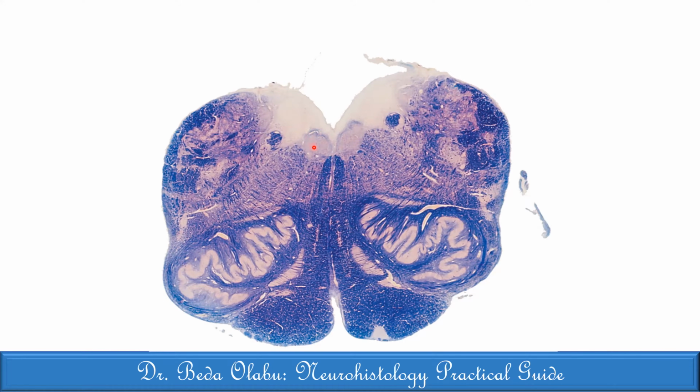Here where the doctor is pointing, behind it will be... I'll leave it at that. Doctor, that's what I can be able to see. There are various nuclei. Okay, that's okay. We don't have to identify the smaller nuclei, don't worry, that's very good. I like the description you've given.